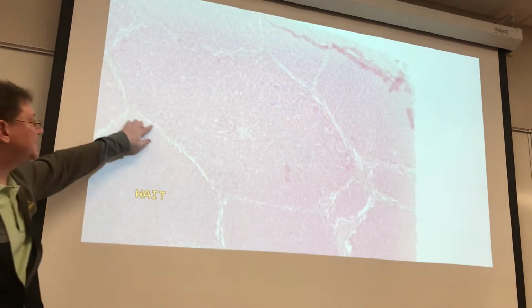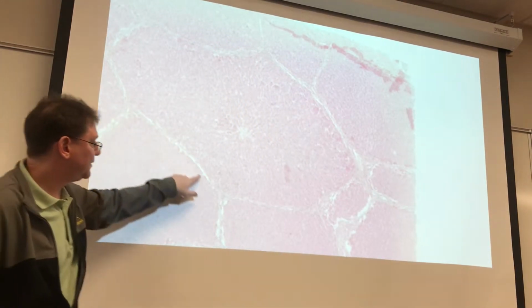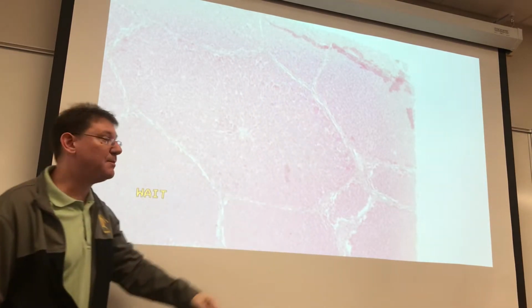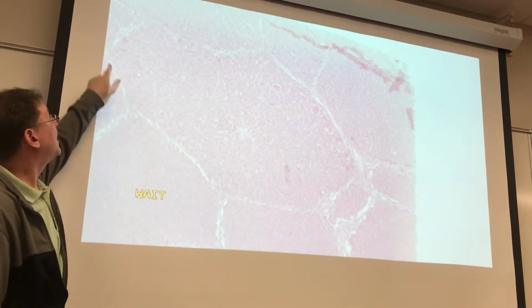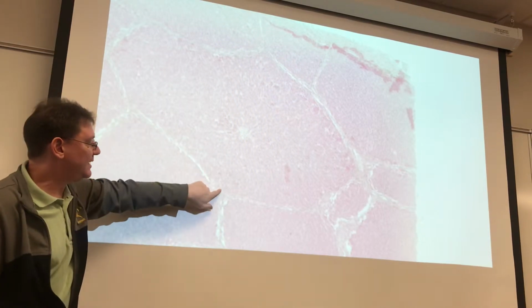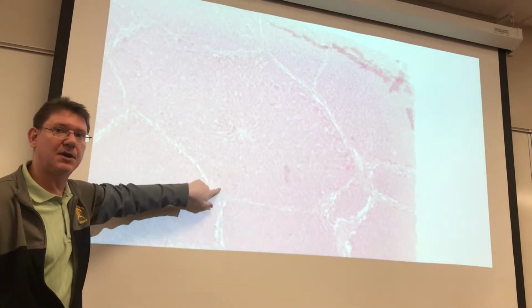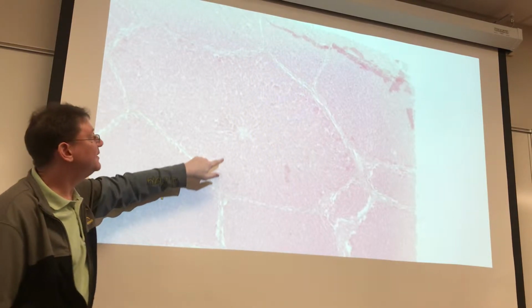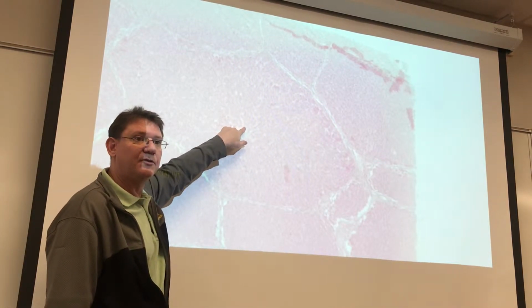See how this lobule has connective tissue acting as a border to give it a shape. This is slightly hexagonal. So at each one of the corners of the lobule of the liver is the hepatic triad. In the center is a central vein.